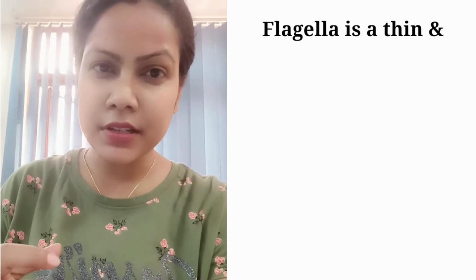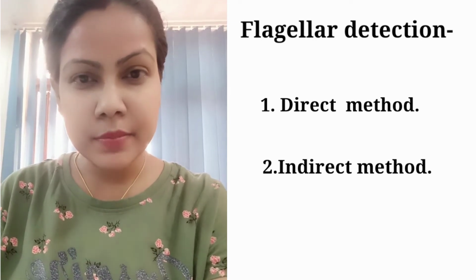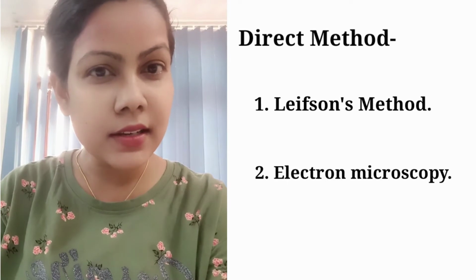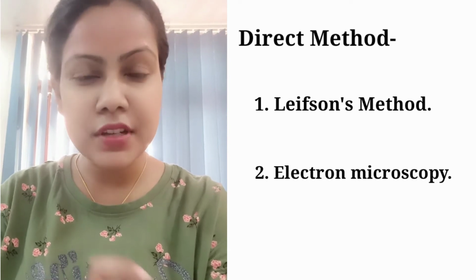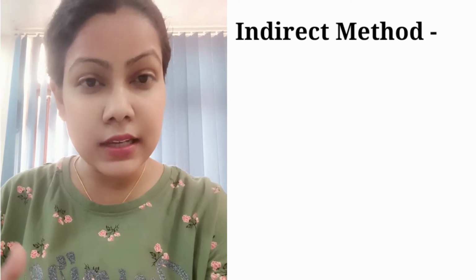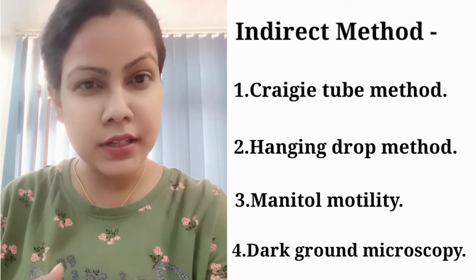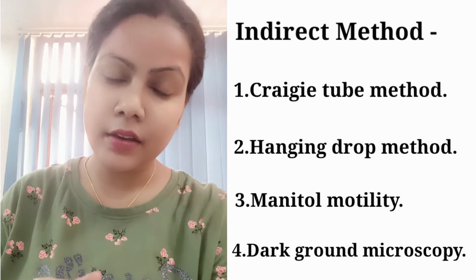So flagella can be detected by direct method or indirect method. In the direct method, we use Leifson's staining, also called Leifson's method, and electron microscopy. Now in the indirect method, we detect flagella by the Craigie tube method, hanging drop method, mannitol motility, and dark ground microscopy.